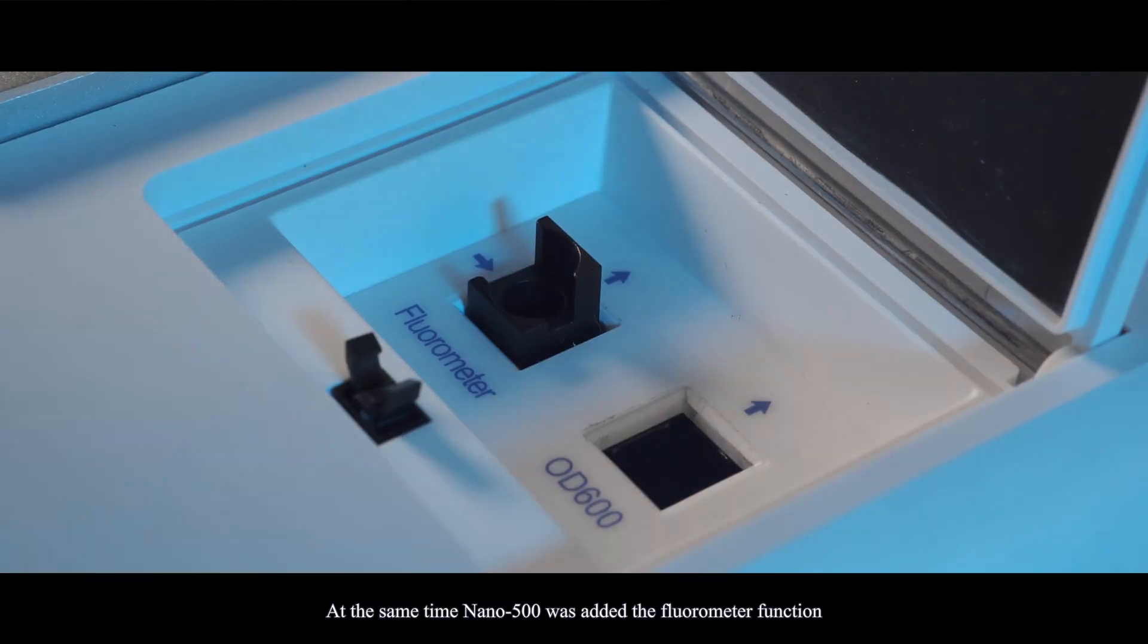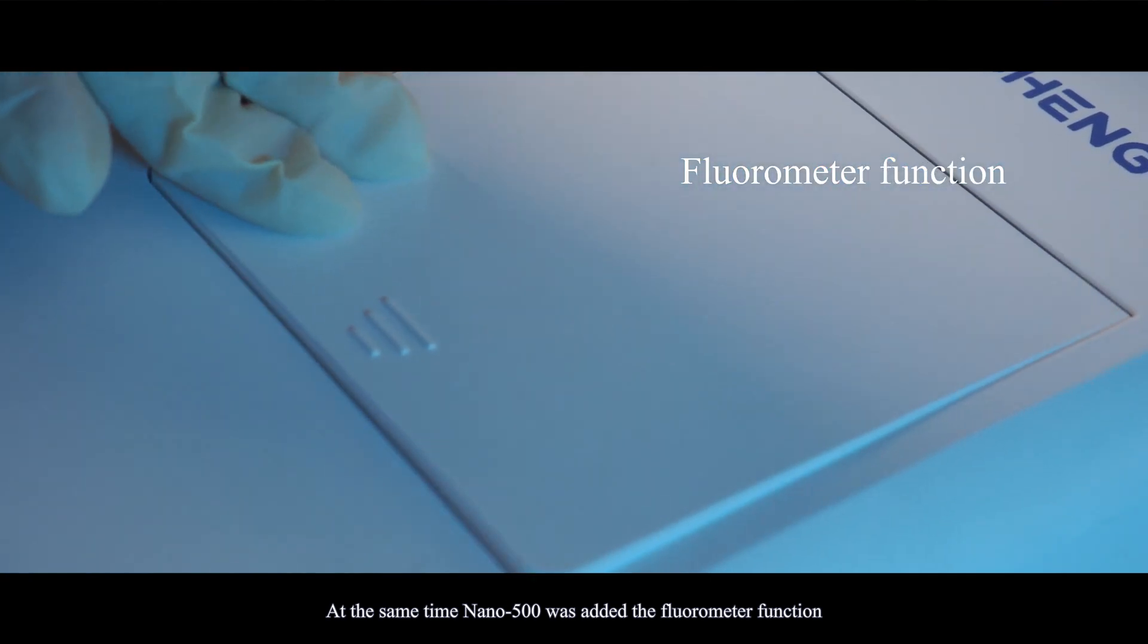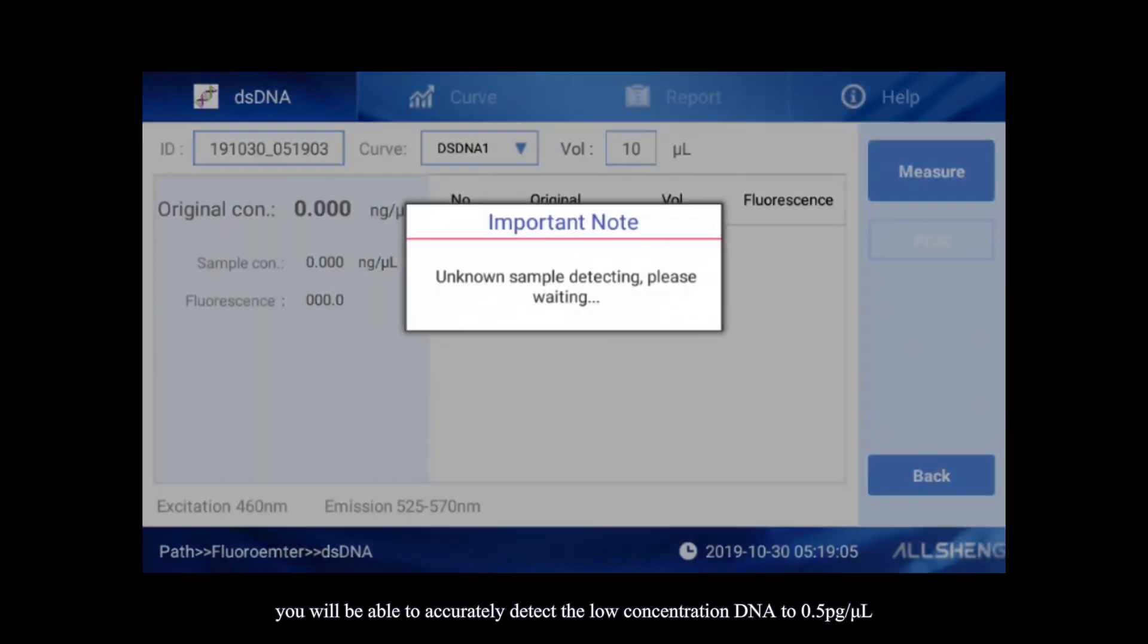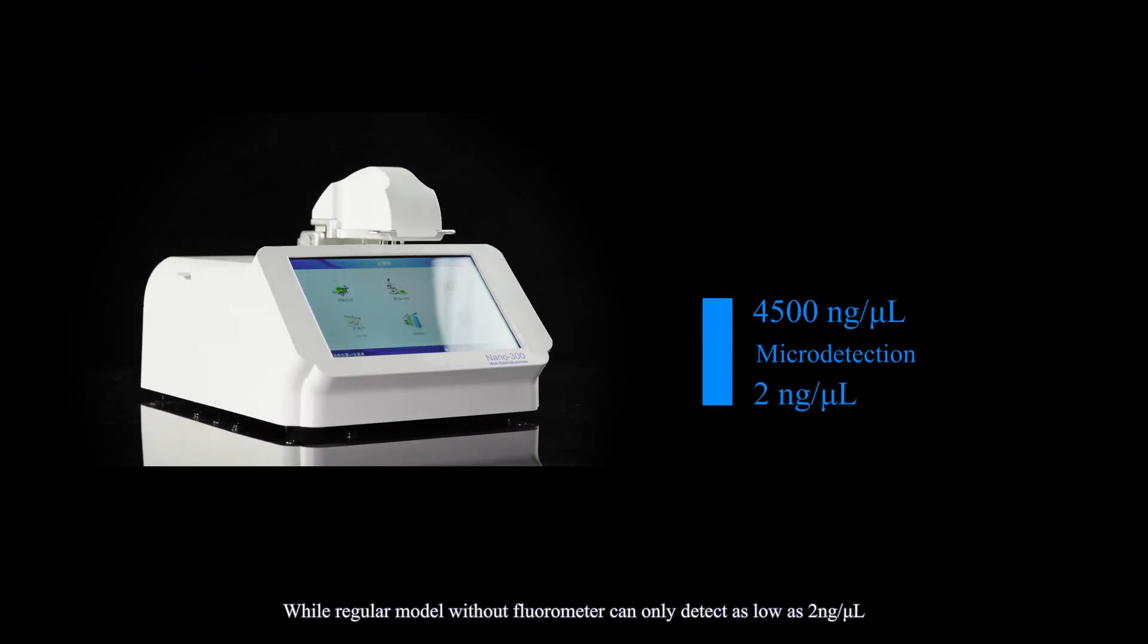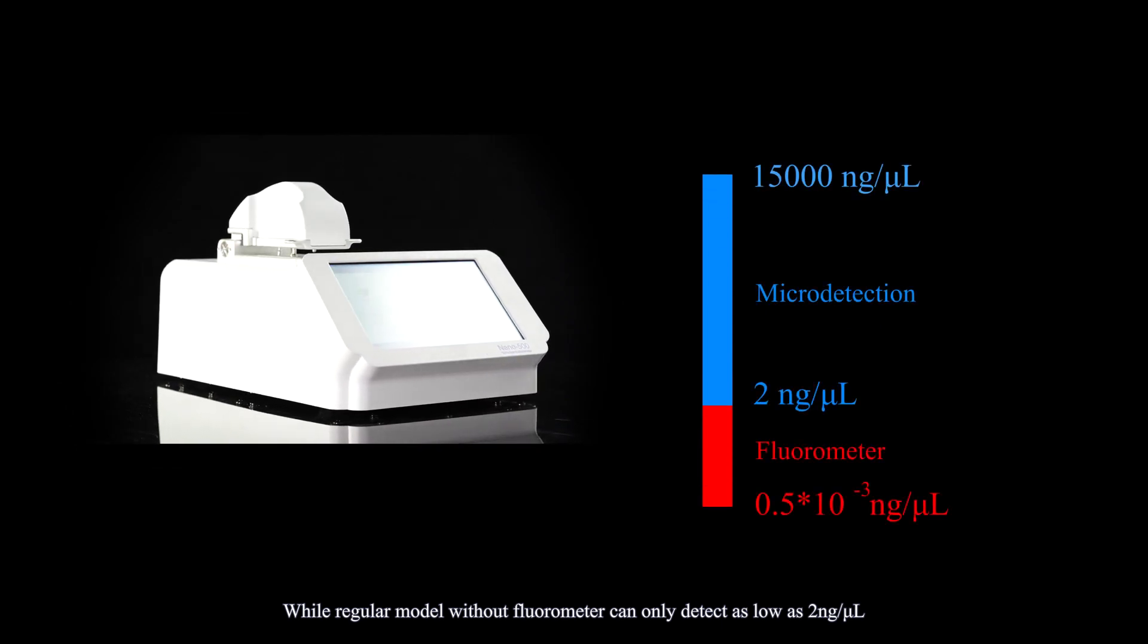At the same time, Nano 500 was added the fluorometer function. With the fluorescence kits, you will be able to accurately detect the low-concentration DNA to 0.5 picograms per microliter, while regular models without fluorometer can only detect as low as 2 nanograms per microliter.